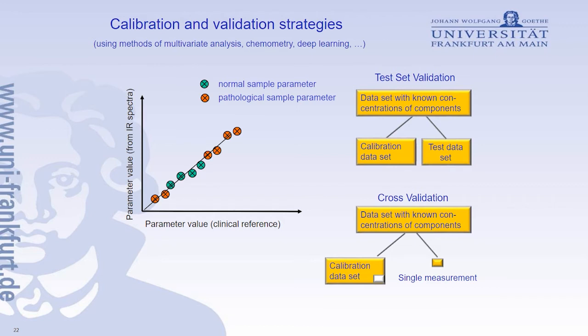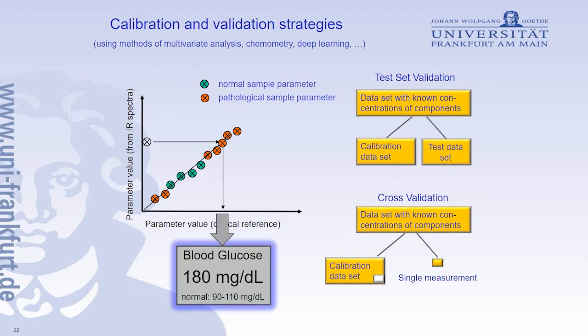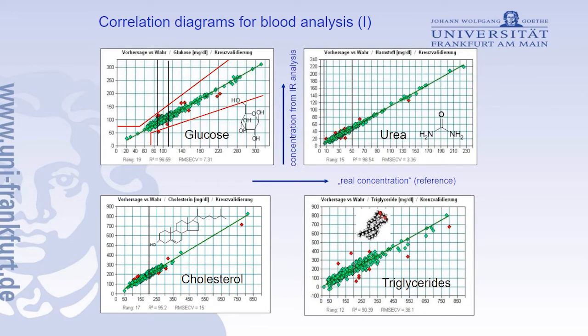Now, once you've done a calibration this way, you take an unknown sample, project it on here, and you get the clinically relevant value, which, for example, could be the blood glucose value just determined non-invasively. If we follow that line, we can actually state that here at least 8 parameters, in practice like 10 to 12 parameters, can be determined at clinical precision.